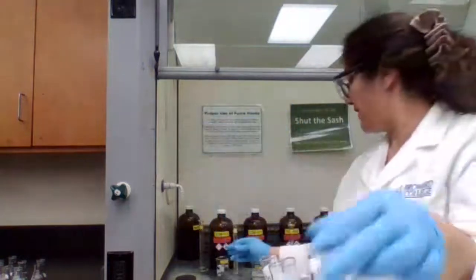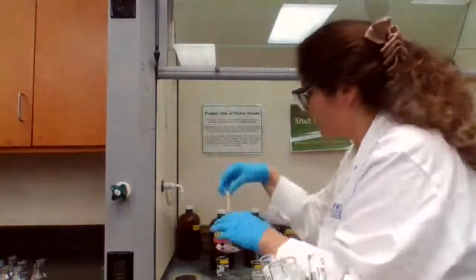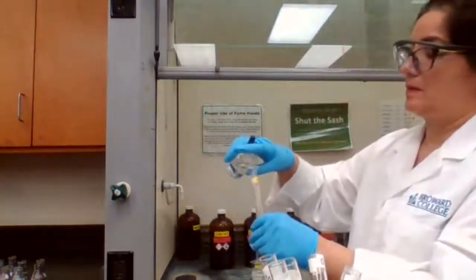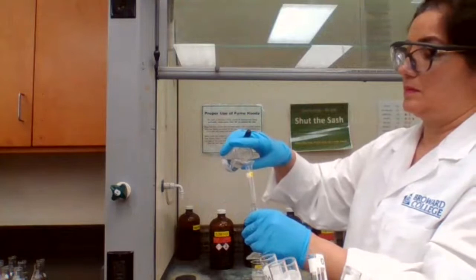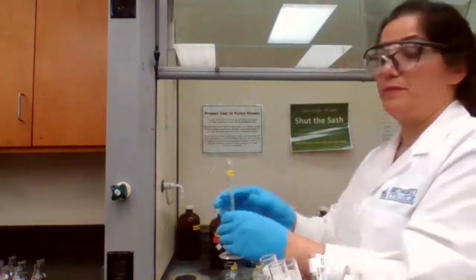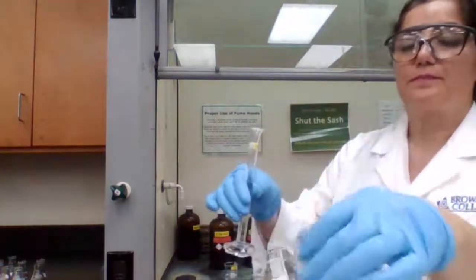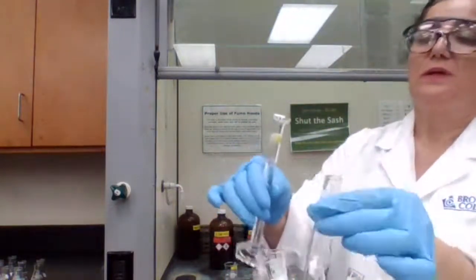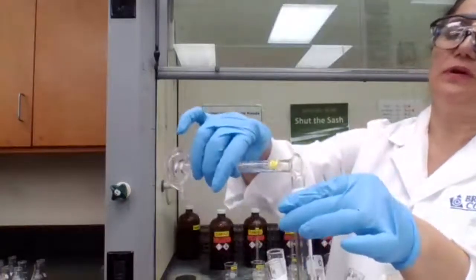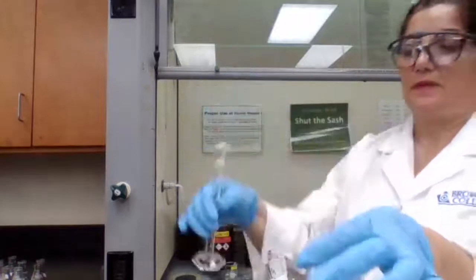And to test tube 5, I'm adding 10 milliliters of 0.2. I have them labeled as 0.2, 0.4, 0.6, and 1 molar, so I don't get confused later.